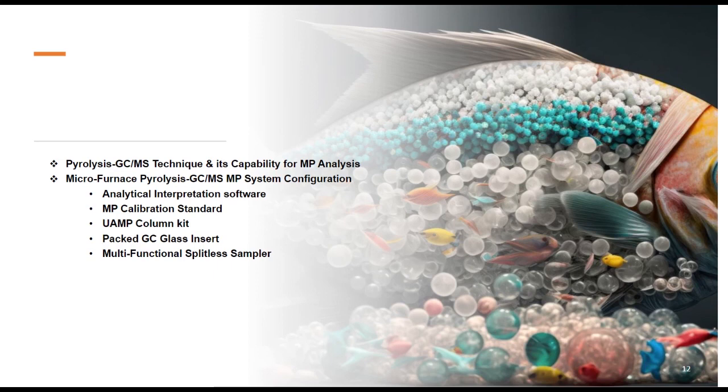Although microfurnace pyrolysis GCMS has a very broad application in polymers and additives, we focus on microplastic analysis in today's event. We will briefly go over the capabilities of the microfurnace, but we also have many other available resources for you that go into much detail about this technology and its application.